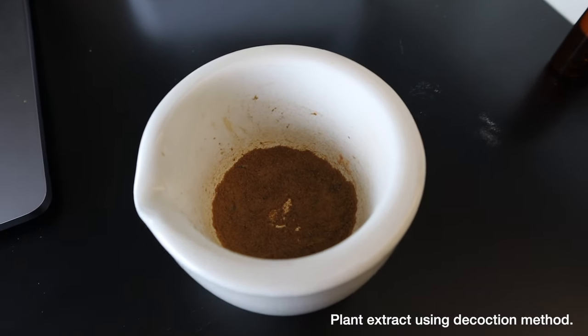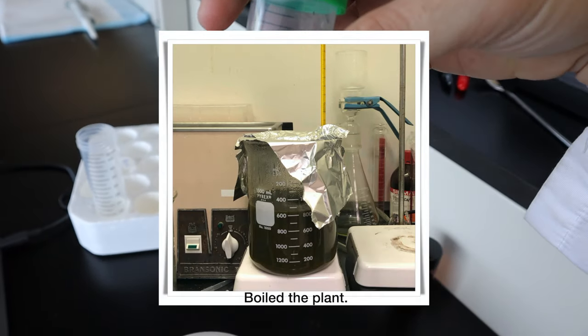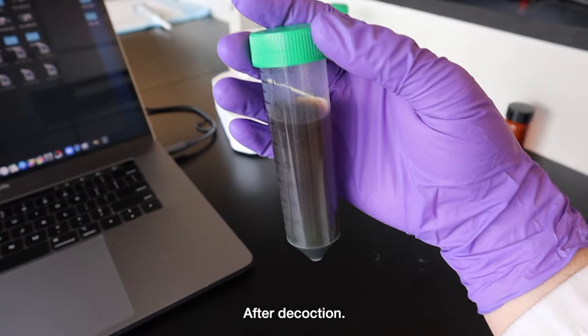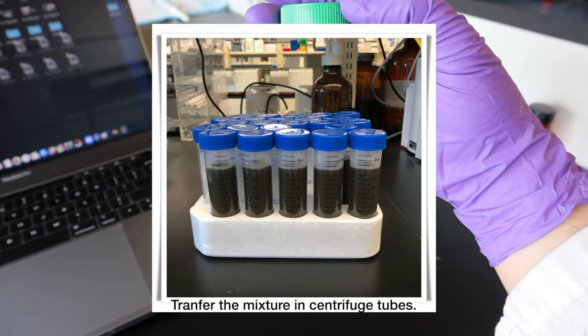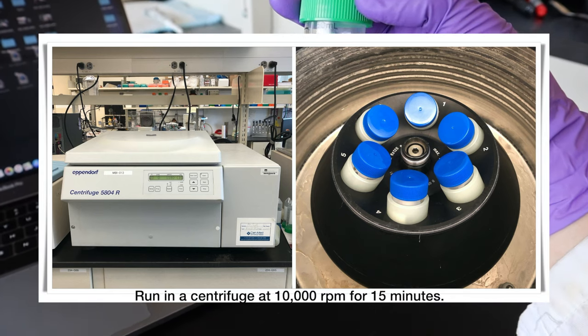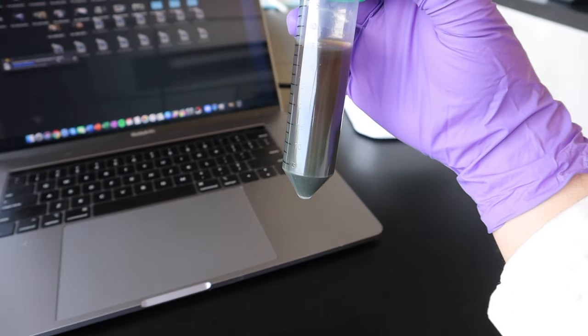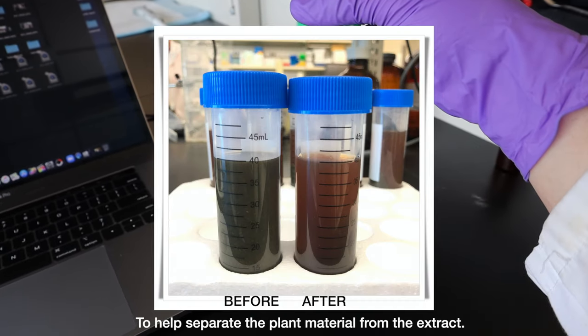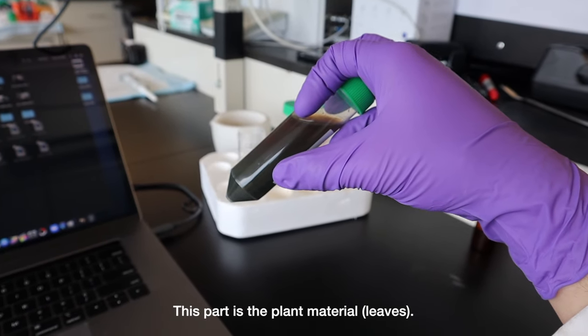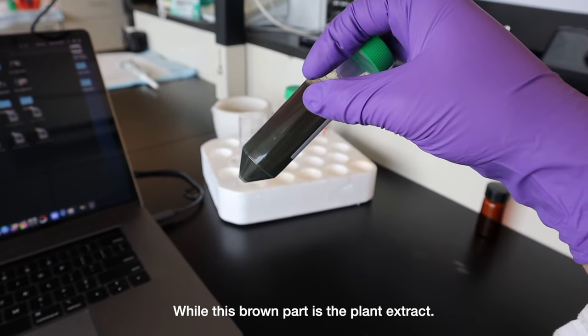Here's a different kind of extraction. We boil the Corchorus olitorius leaves in water. We transfer the mixture in a centrifuge tube. Then, we put it in a refrigerated centrifuge. We have to separate the plant material from the extract. This part is the plant material, while the supernatant part is the plant extract.